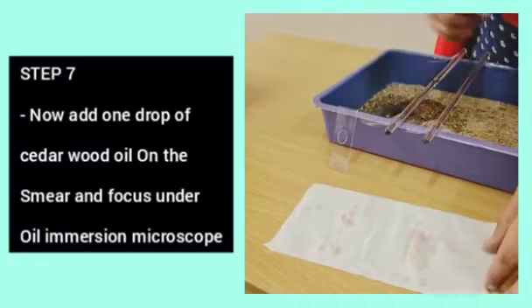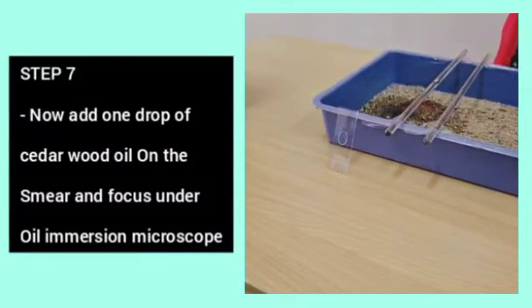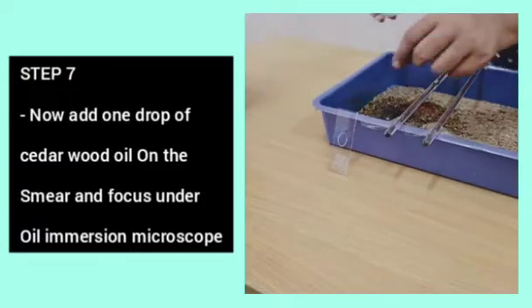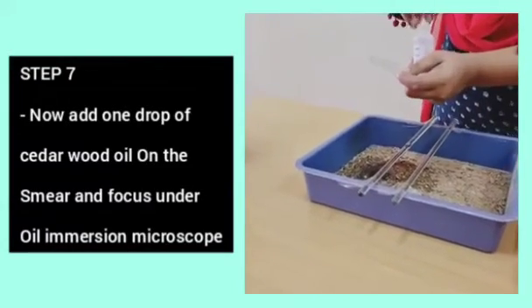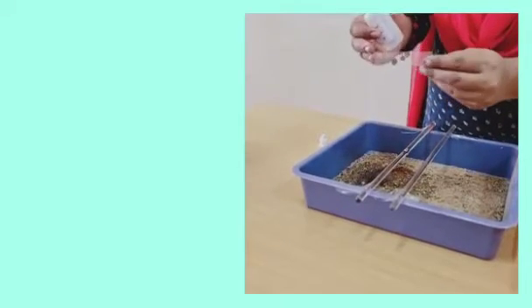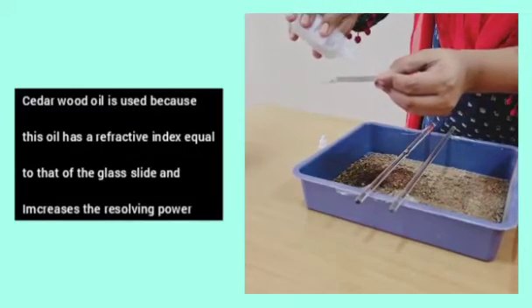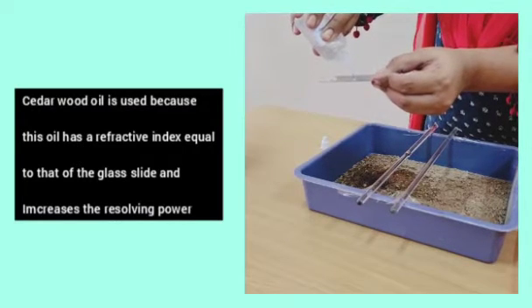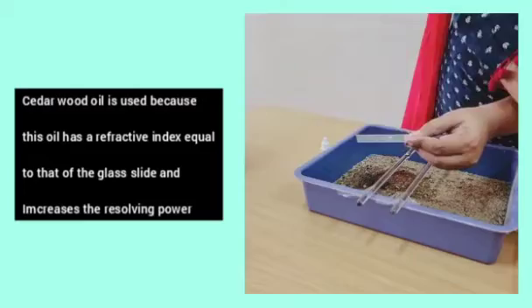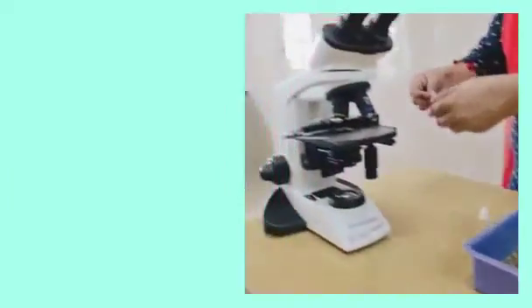Step 7. Now, add 1 drop of cedarwood oil on the smear and focus under the oil microscope. Cedarwood oil is used because the oil has a refractive index equal to that of the glass slide and increases the resolving power.